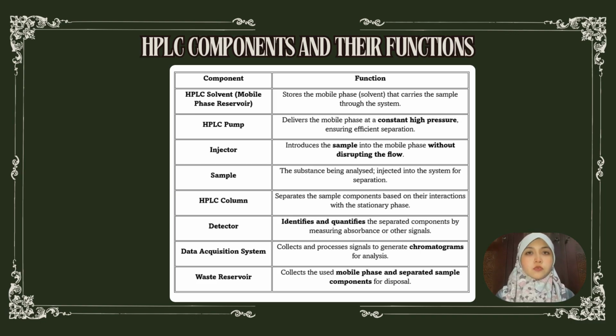Last but not least, we have the waste reservoir, which is where the used solvent and sample residue are collected for proper disposal. So that's all for the HPLC components and their function.